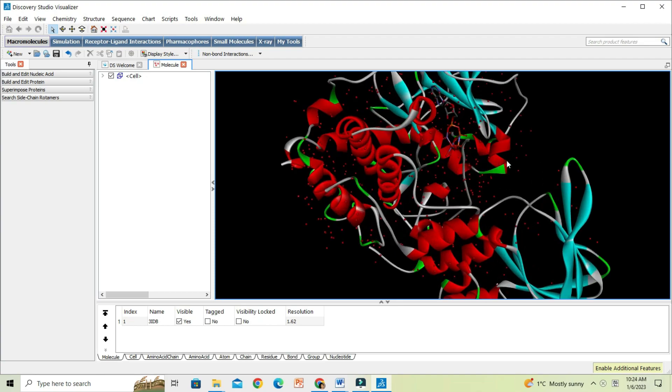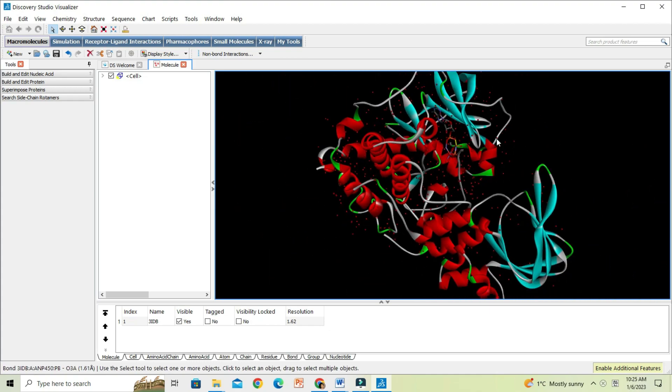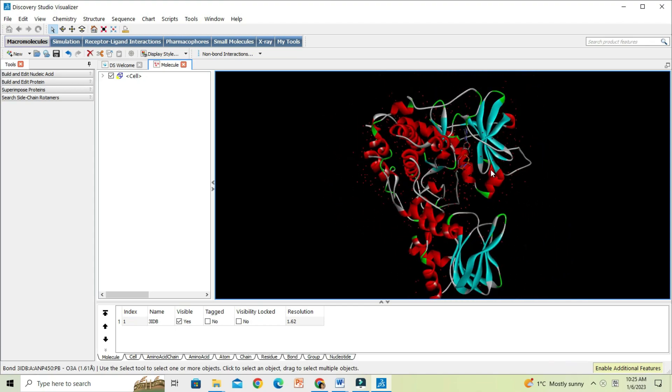To remove all unwanted molecules attached to the protein structure, what I will do is double-click on the protein molecule alone. It will select and highlight the protein structure.